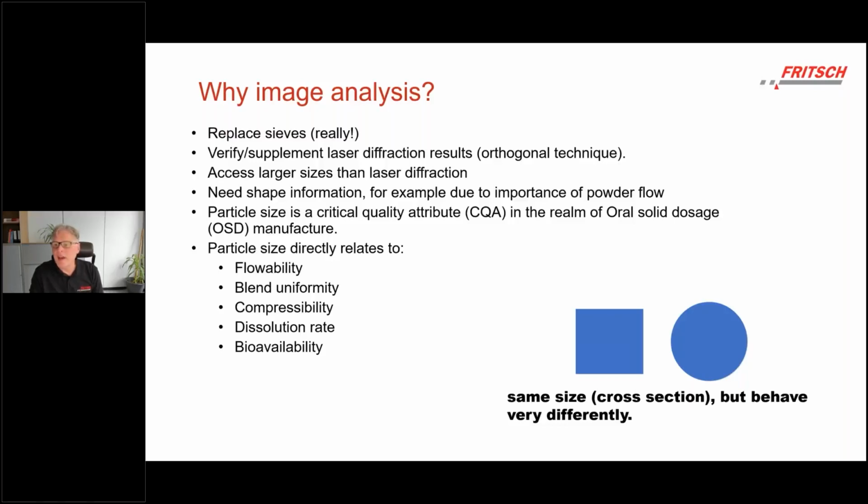But besides particle sizing itself, so the question, what size do the particles have? What is the size distribution? What does the size distribution look like? More and more people also need some information about the shape of the particle and the shape distribution. And there are a lot of examples for this.